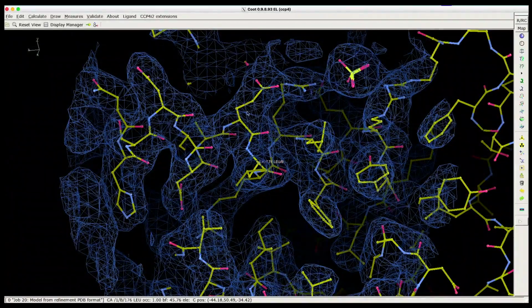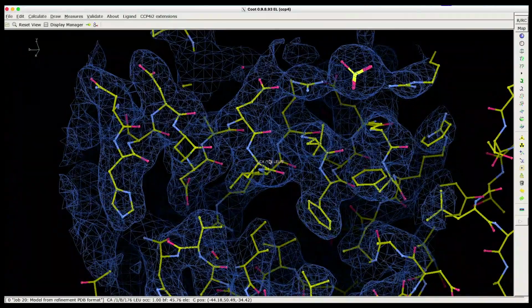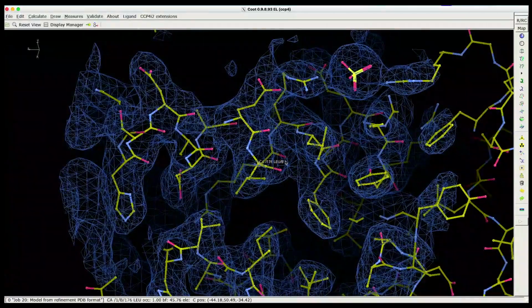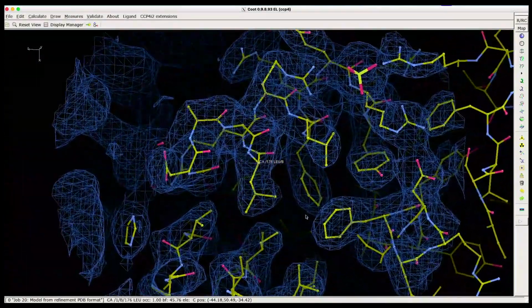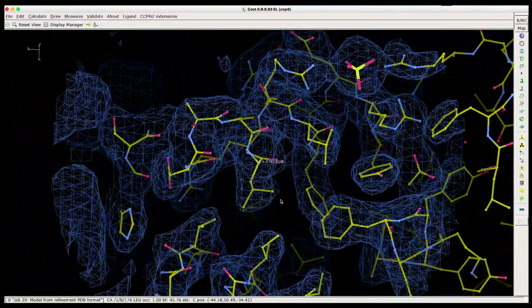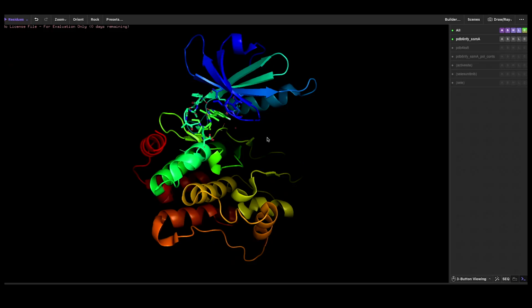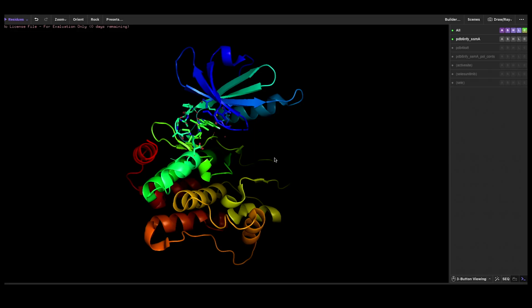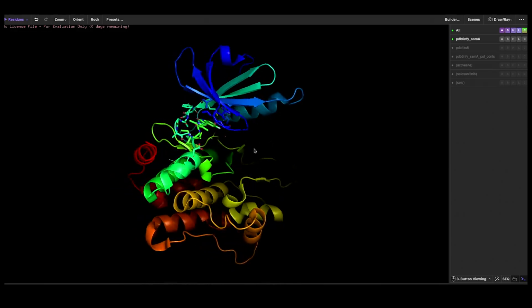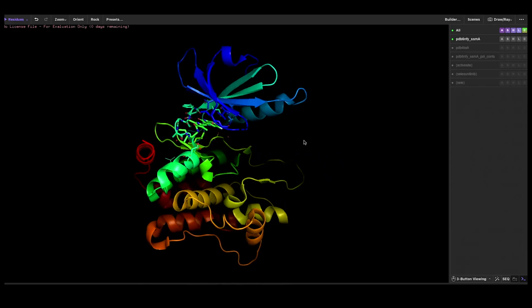Here is an alpha helix, comes along there. This is a so-called graphics program that is visualization of the electron density, and it's three-dimensional, so you get a feeling of the depth. You can see things that are in the front and behind. Here is another graphics program that is more focused on the visualization of the protein. Looking at the electron density and the amino acids in the stick type representation or line representation doesn't give you the full overview.